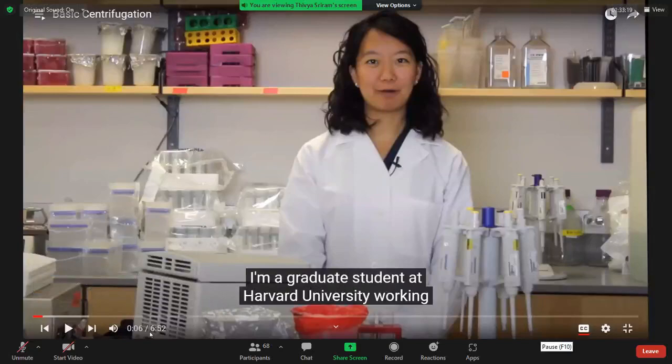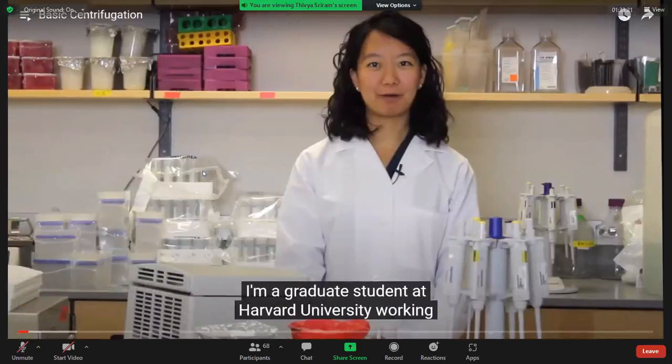Hi, I'm Marie. Now we will see how the centrifuge works, how from a particular solution the liquid as well as the solid part gets separated. Here, for that purpose, we are going to use the centrifuge apparatus.